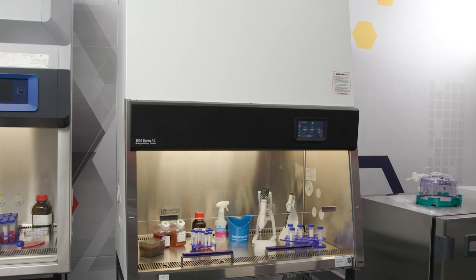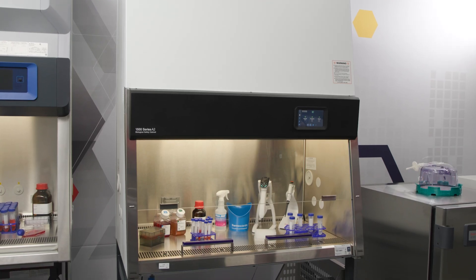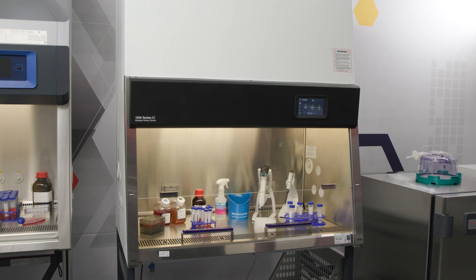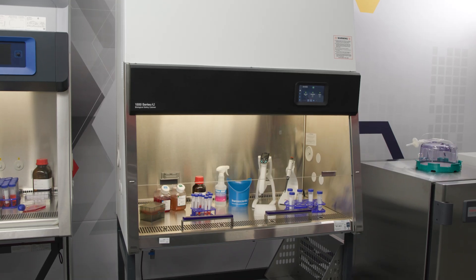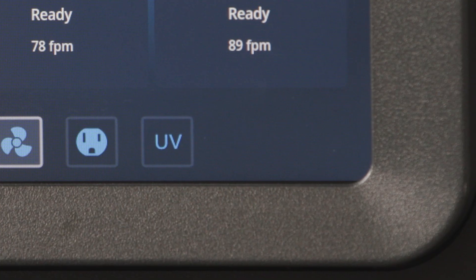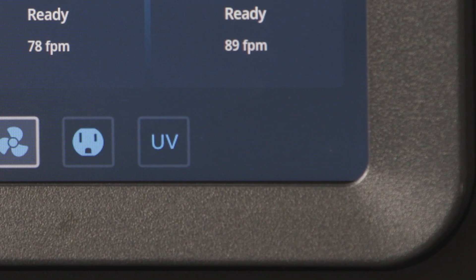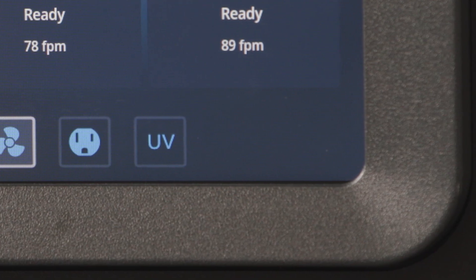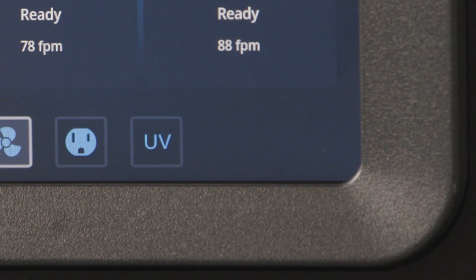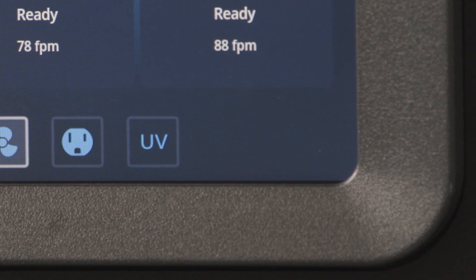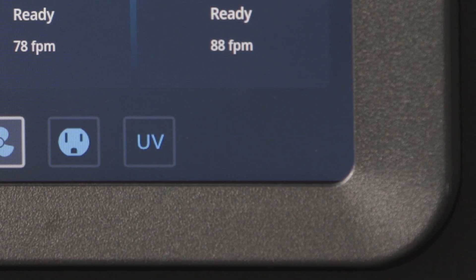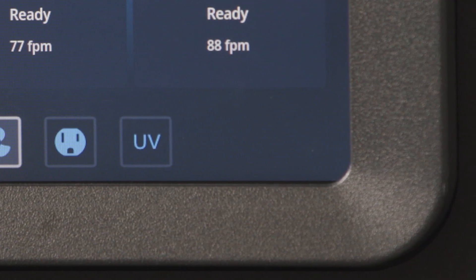The last control icon is for the UV germicidal light, which we address in a separate video. Watch the UV light video for this unit in our How to Operate series to learn more about this function.